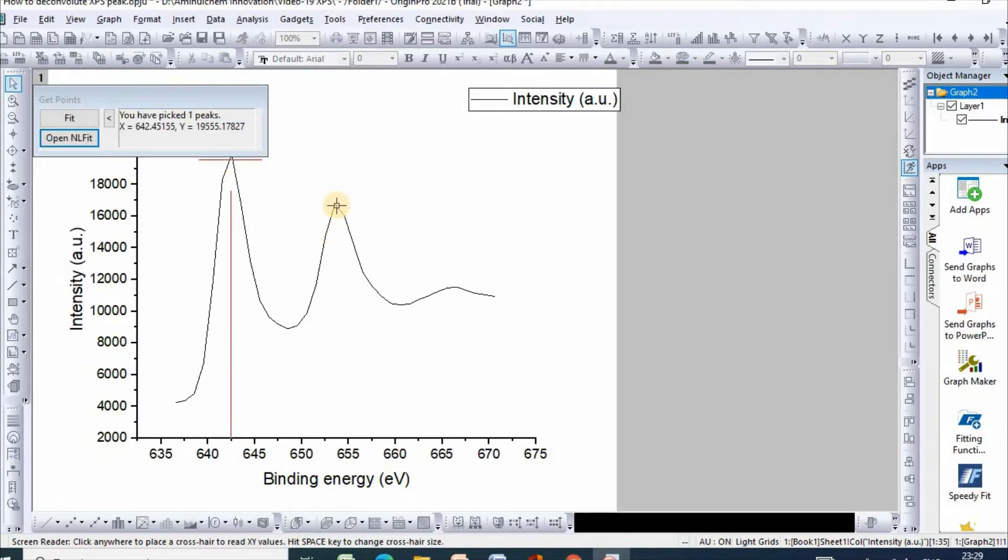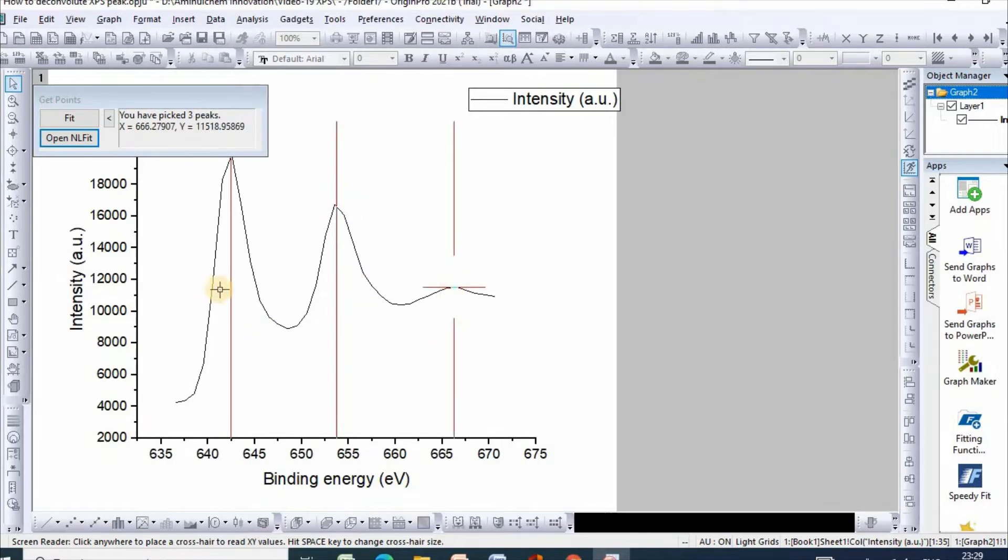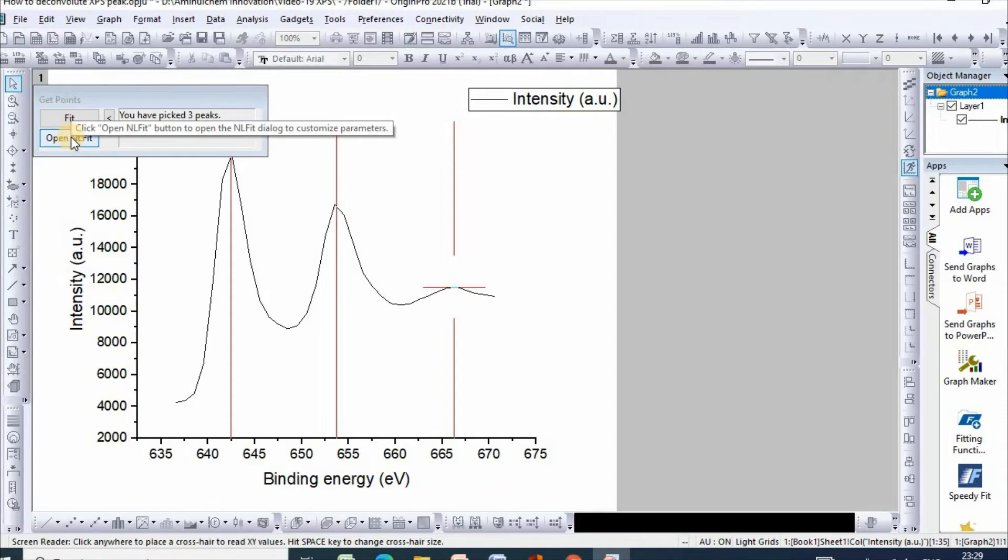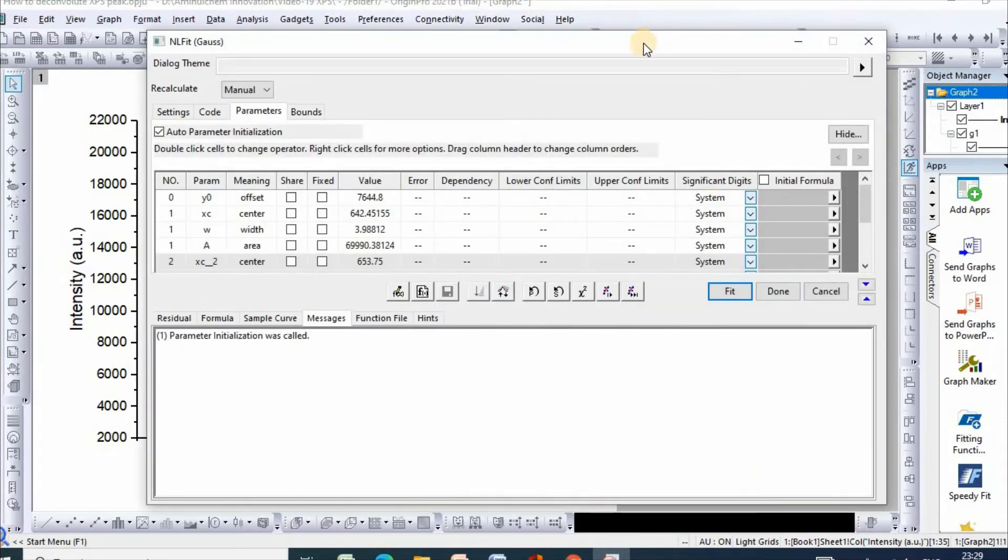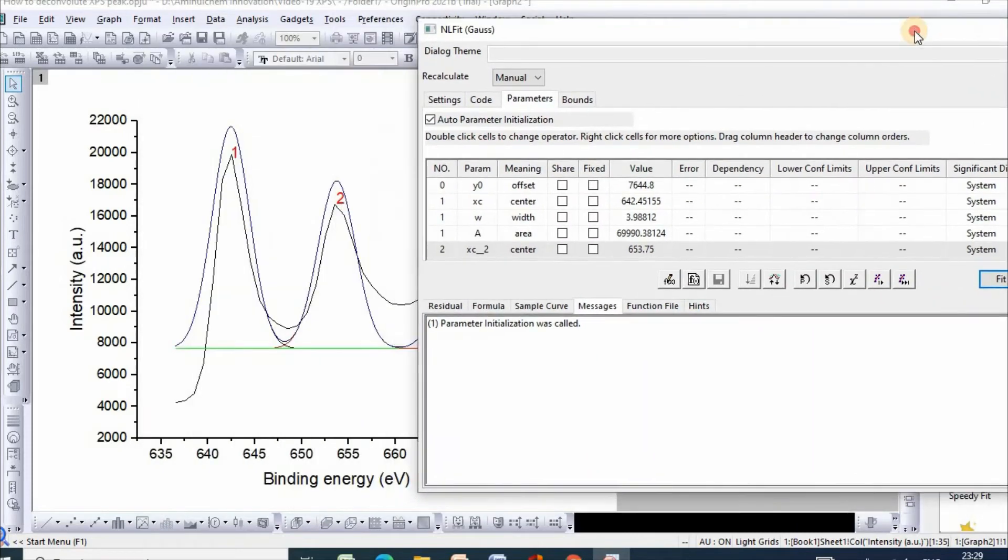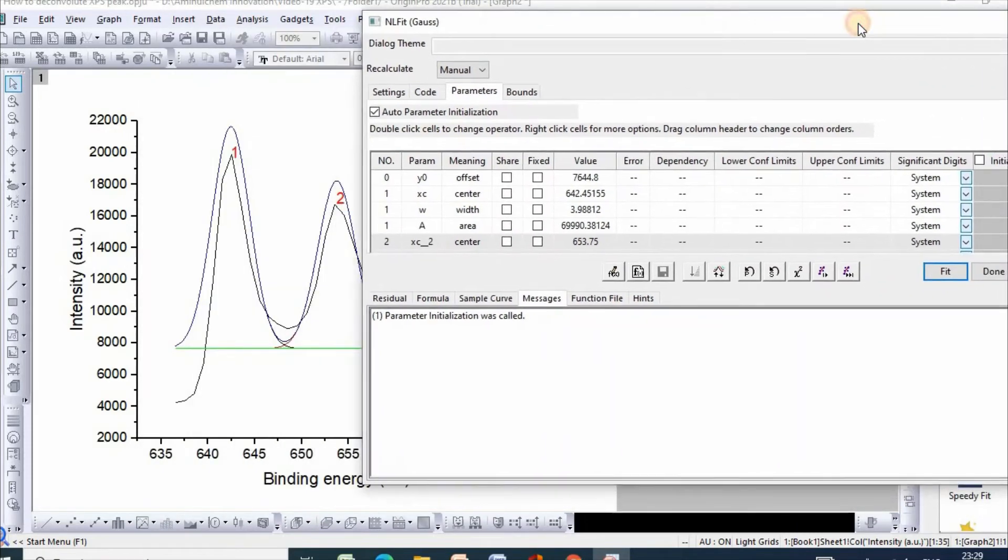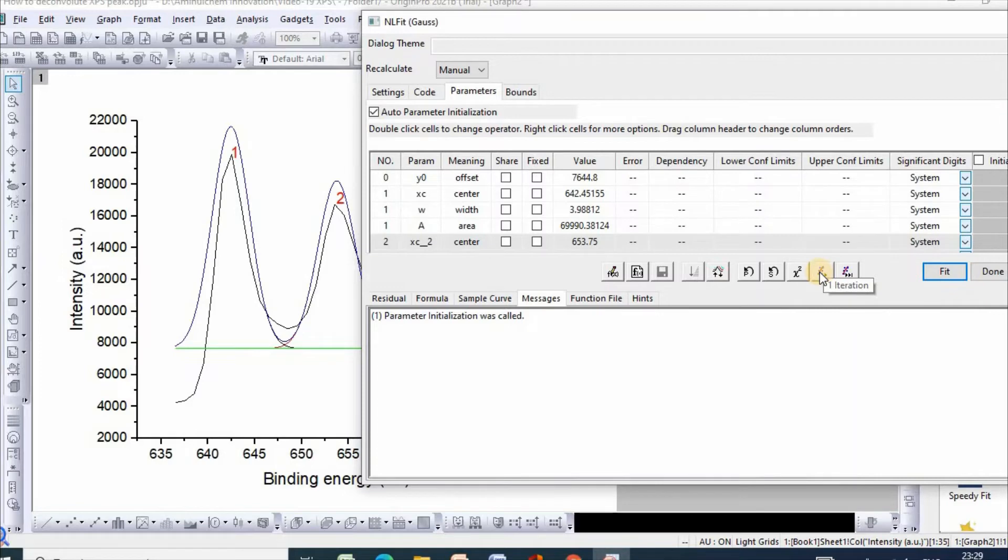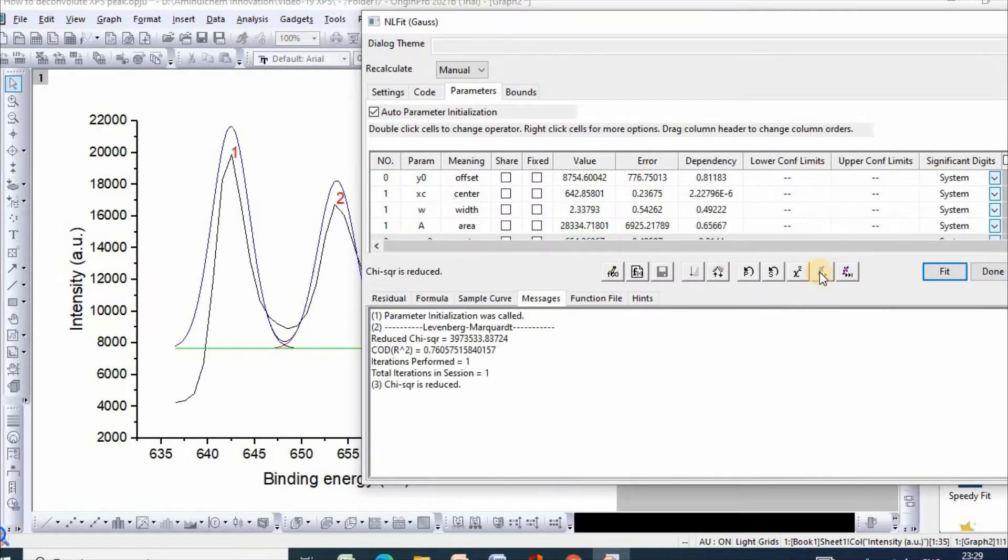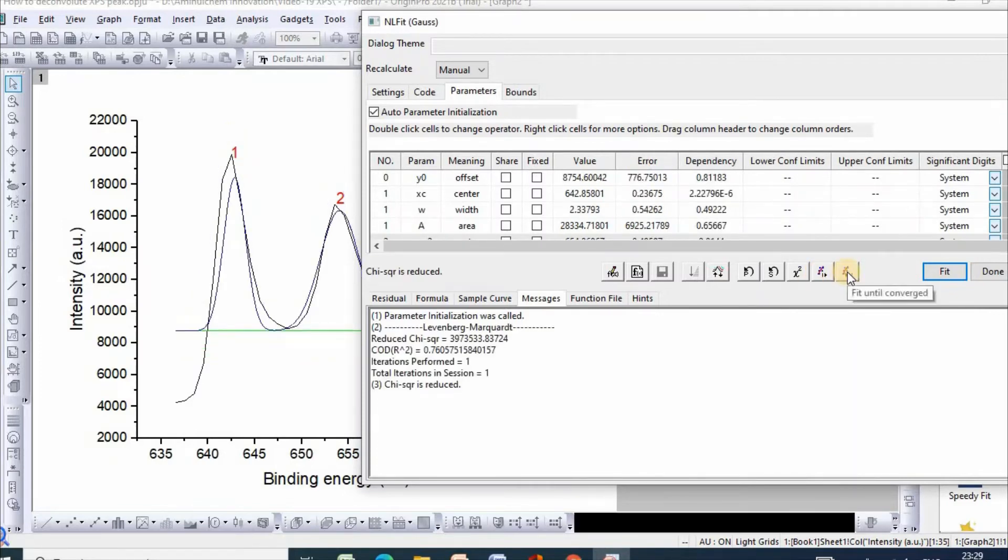Click on another peak, and here is another peak. So three peaks are selected. Then open NL Fit. This panel will appear. Then click on One Iteration, then click Fit Until Converged.